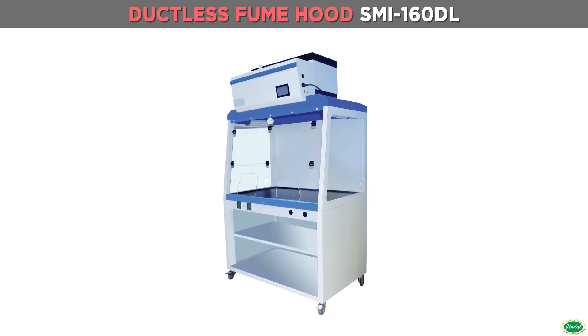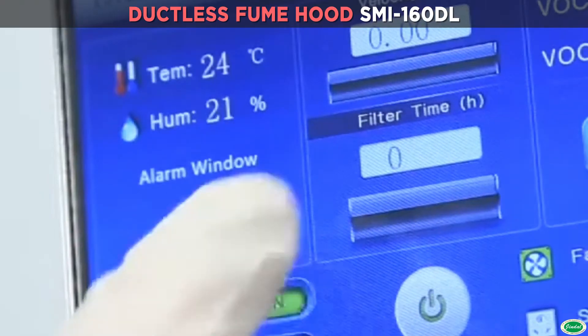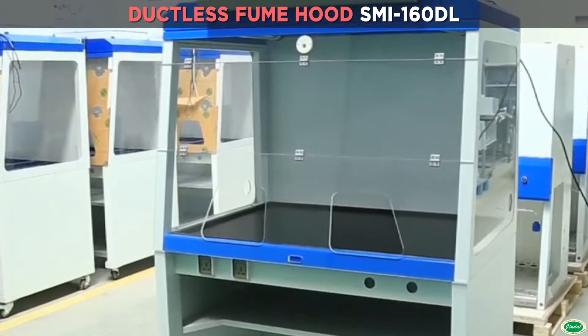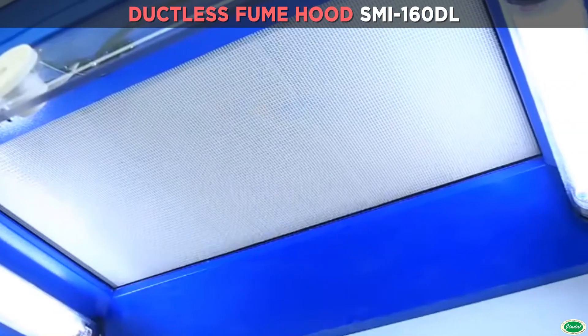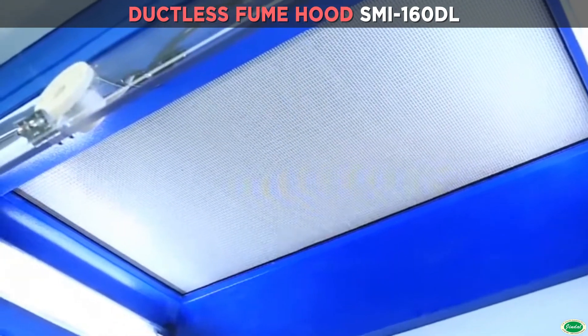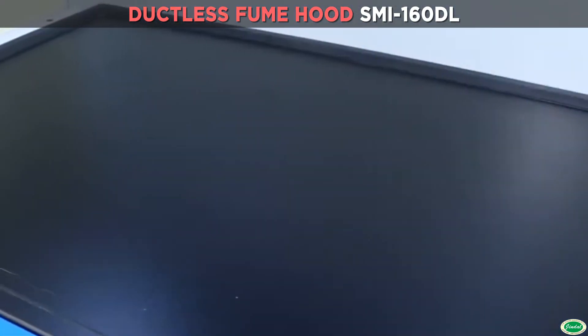Ductless fume hood ME 160 DL advantages: LCD touchscreen control panel, easy to operate with memory function in case of power failure. Eight-degree slope front ergonomics design provides fatigue-free working posture. Temperature and humidity sensors can detect indoor temperature and humidity.